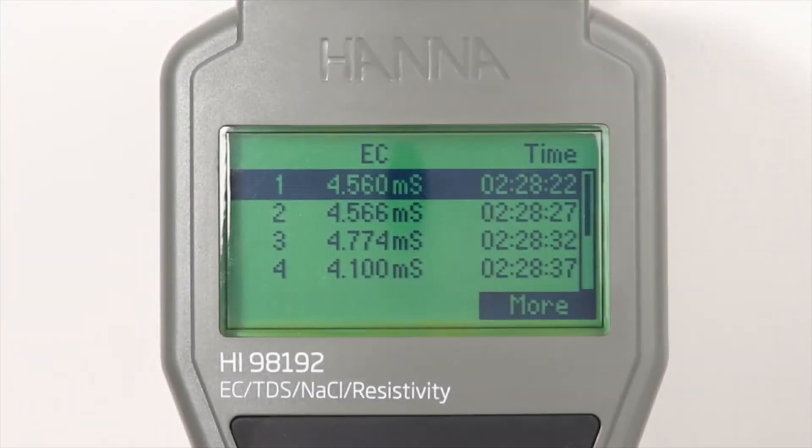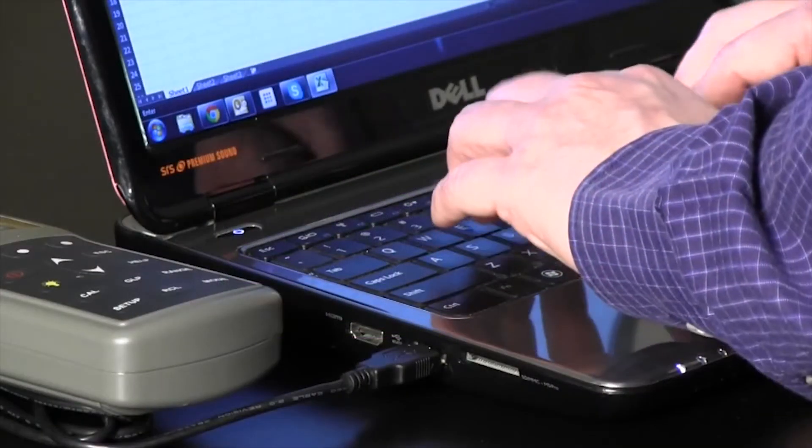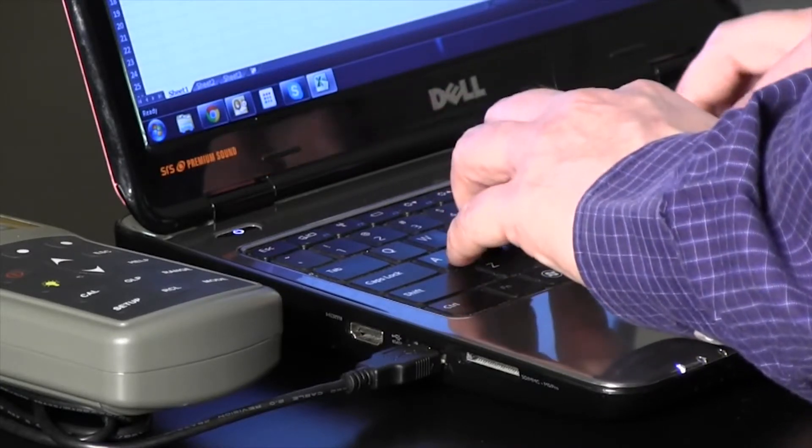Logging data is made easy with a simple press of a button. These logged measurements can be transferred to a PC using the supplied Windows-compatible software and USB cable.